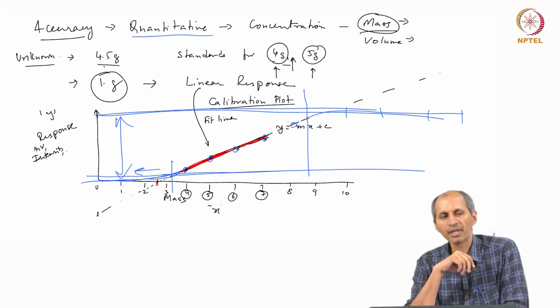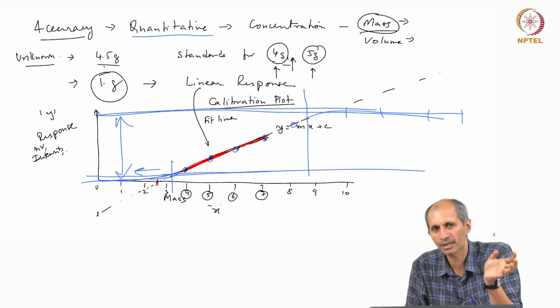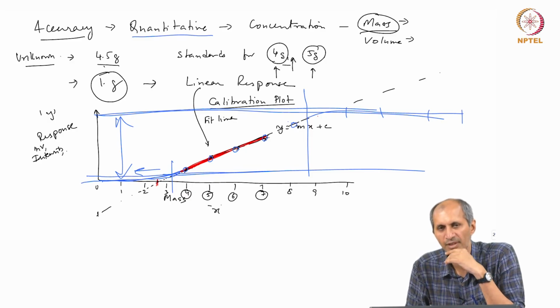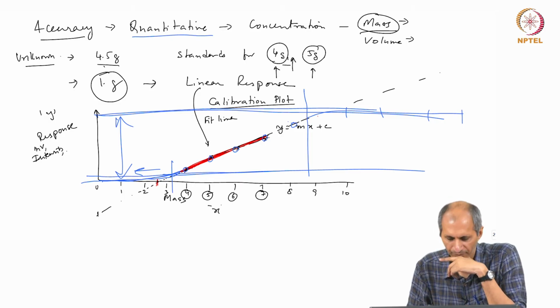Okay. For every instrument you can obtain standards. When people make an instrument, they will also arrange to make standards, or standards will develop over a period of time for that particular instrument by consensus again. So, people will make and propose this as a standard, others will use it and so on and so forth. Okay.